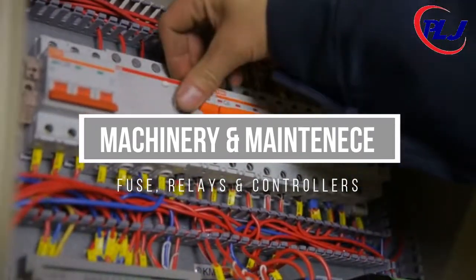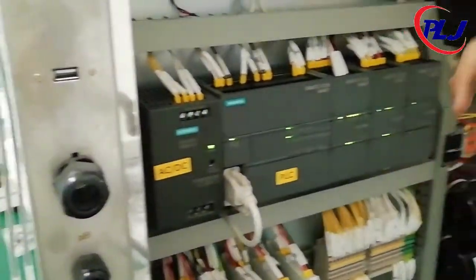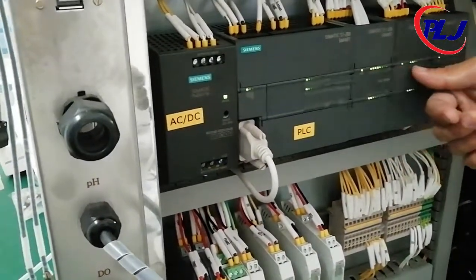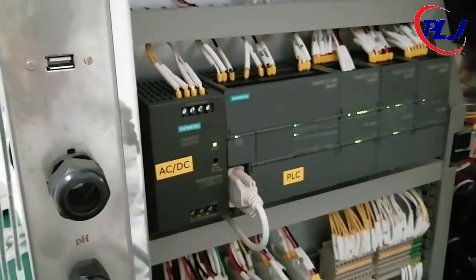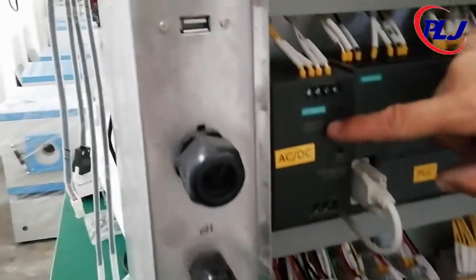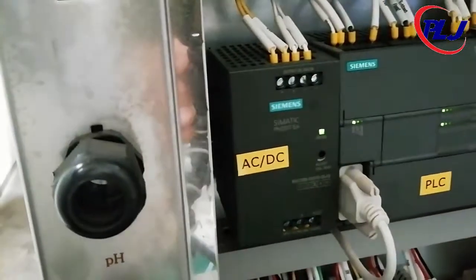Maintenance and electronics. On the left side, we have the AC/DC power supply, which acts as the power source of the system. Further, we have the program logic controller, the PLC. Its function is to control the other mechanical and electronic parts and instill instructions.